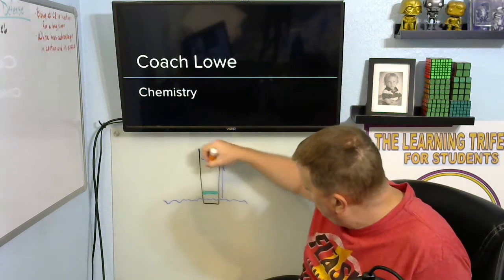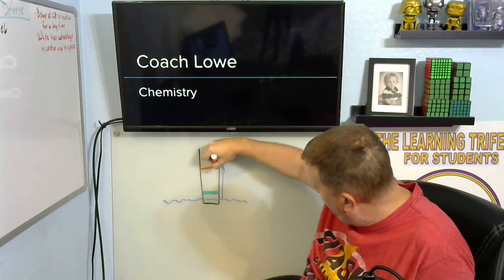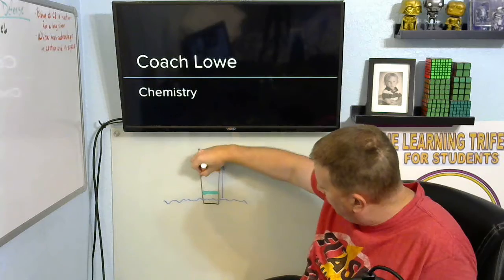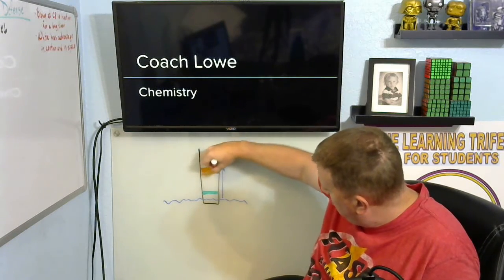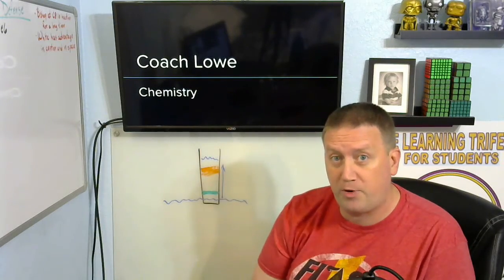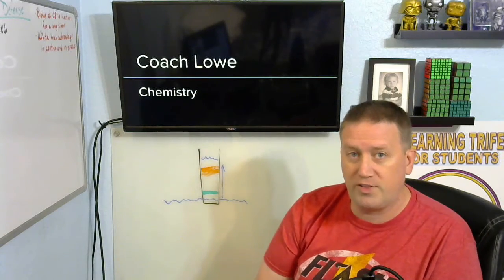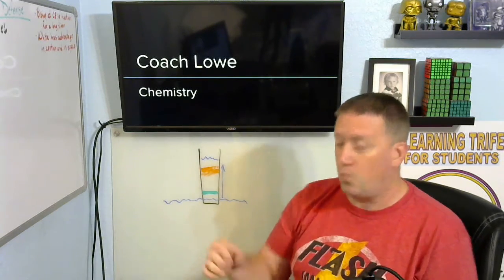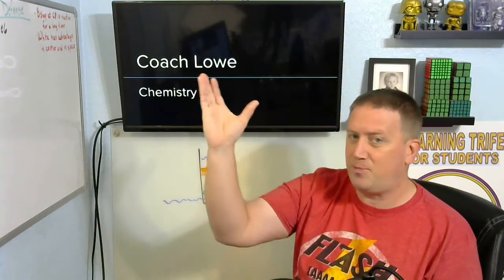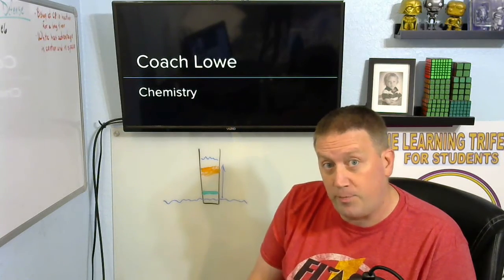The smaller molecules will move up the paper with the alcohol, and it'll form a layer on the chromatography paper. So basically, as the alcohol is moving up the chromatography paper, it's carrying those smaller particles along with it. And eventually, once those small particles get too high and the alcohol can't carry them anymore, then they stay right there at that level on the chromatography paper.